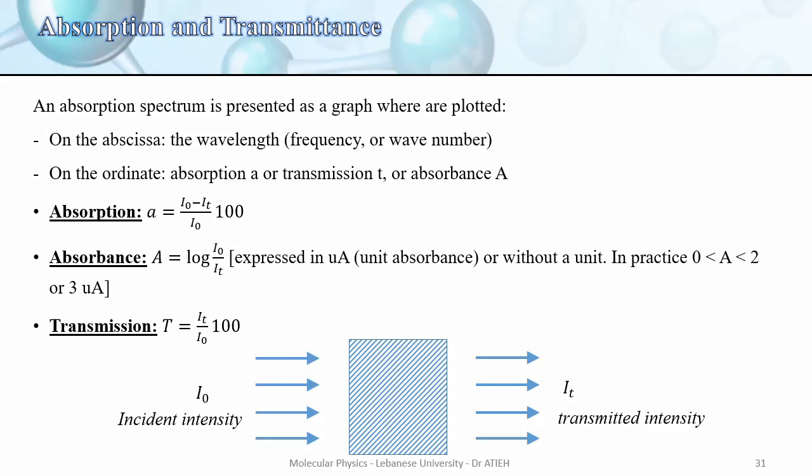Photospectrometry is one of the methods used to determine the concentration of a certain sample by studying the absorbance or the transmission of light passing through the sample, and for sure for monitoring the change in the concentration of the sample as function of time if there is a chemical reaction taking place. Spectroscopy is a very reliable method in determining the concentration of samples. Spectroscopy means the study of how light interacts with matter.